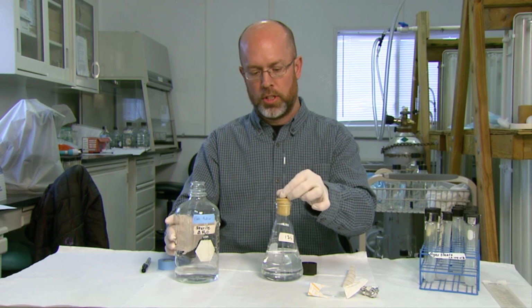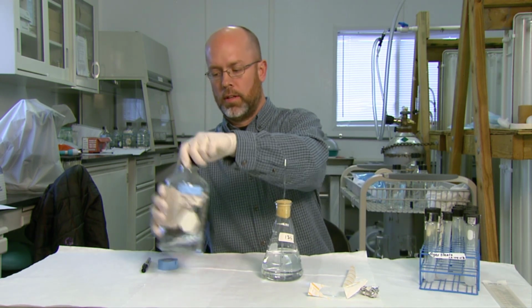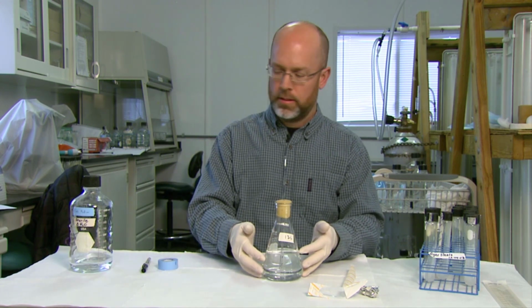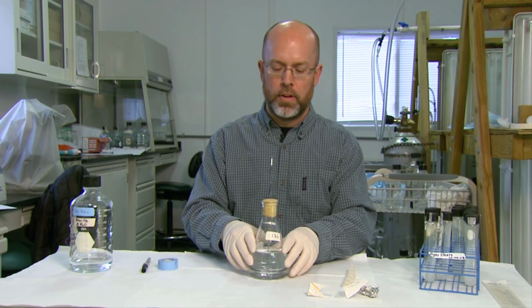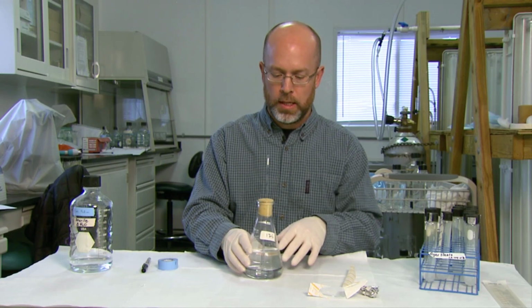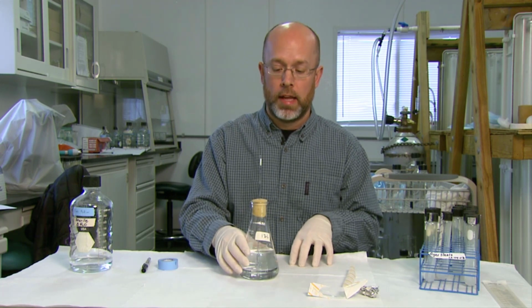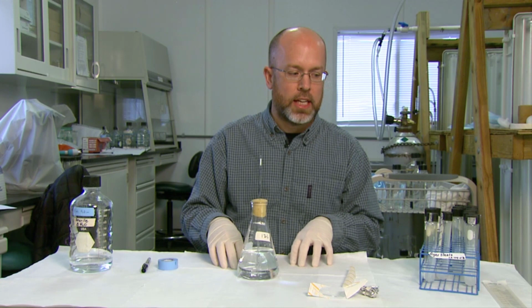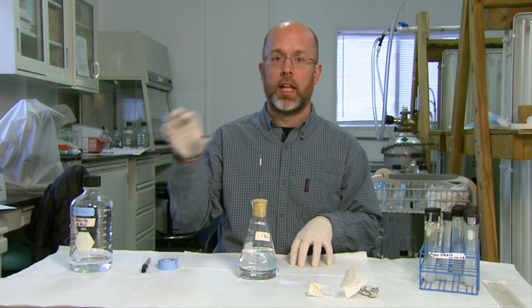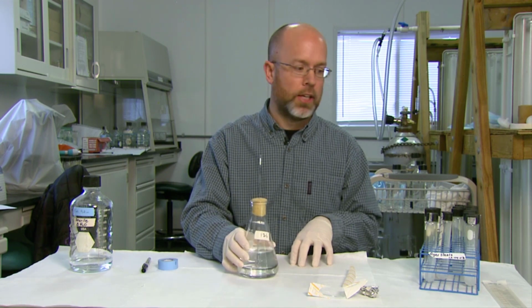And then put the stopper back in. So now what we have is our culture flask, our growth media, our foam stopper to prevent air from coming in, and our bubbling tube. The last thing that we need is our inoculum, or the algae. That process is very much the same as adding algae going from slant to slant, except in this case you're going from slant to flask culture.